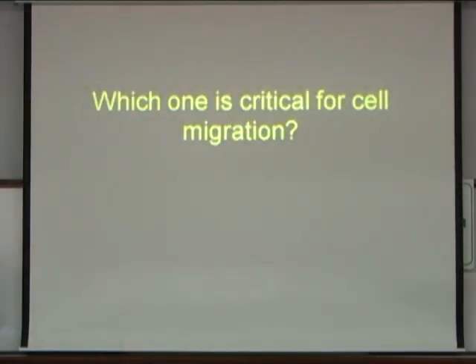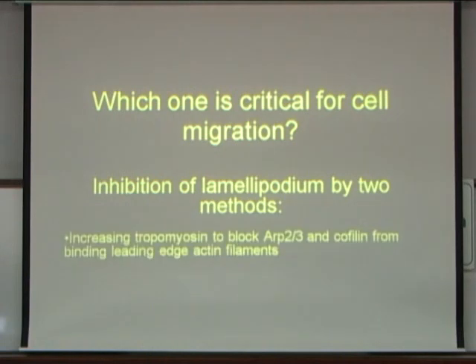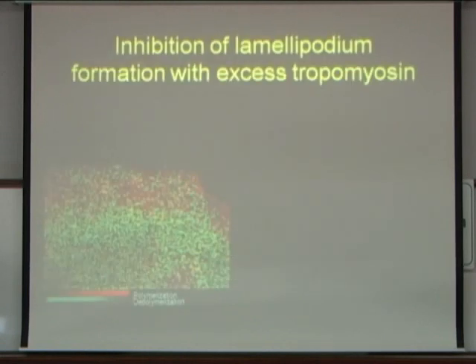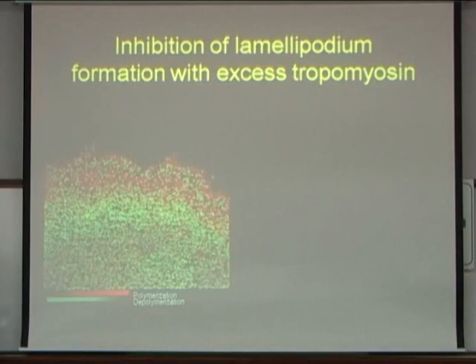So we go to our reductionist friends who make all these tools to knock out the function of specific molecules, and we knock out this one that's supposed to be the king of the lamellipodium, the ARP2/3 complex, in two different ways. And basically the result is that when we knock off the lamellipodium, using our functional criteria, we can watch the movie first.